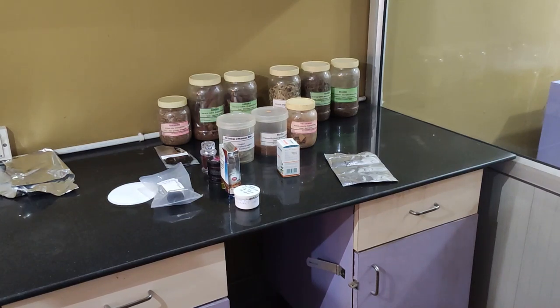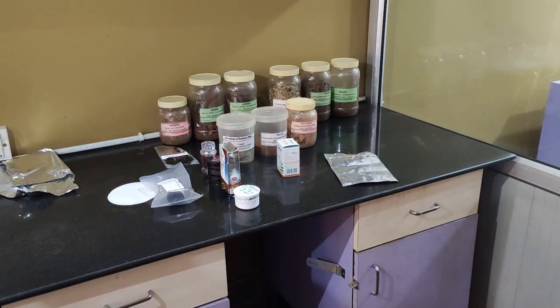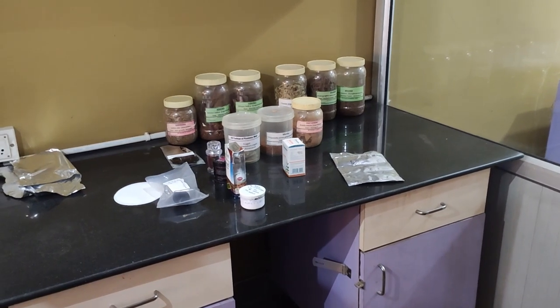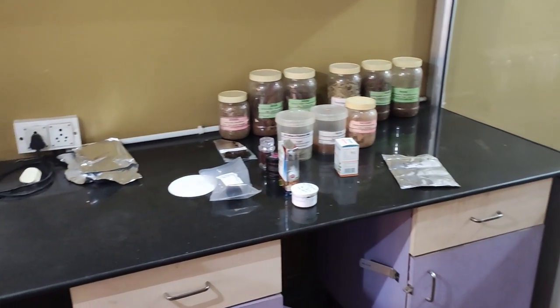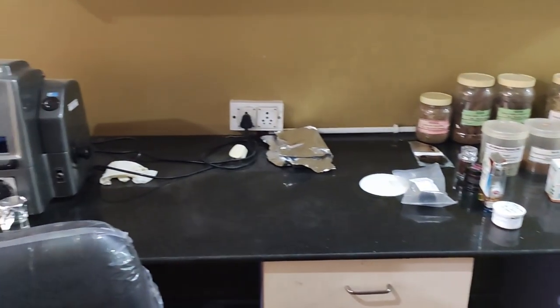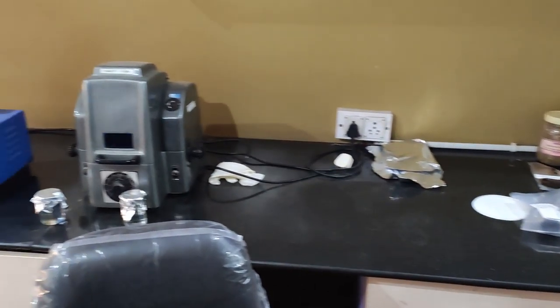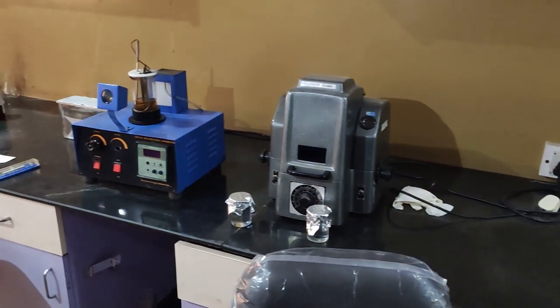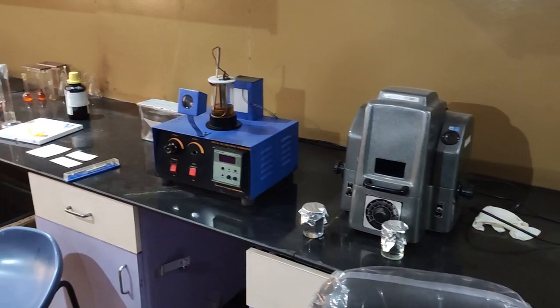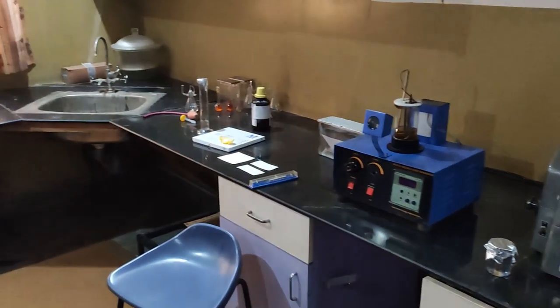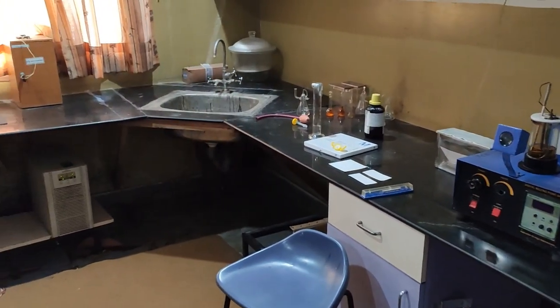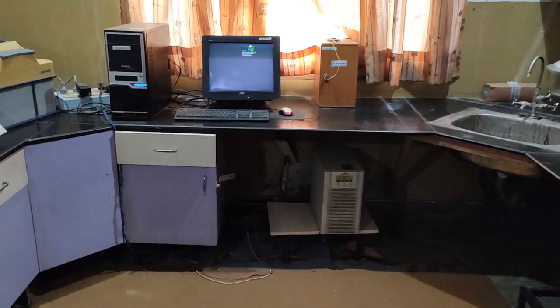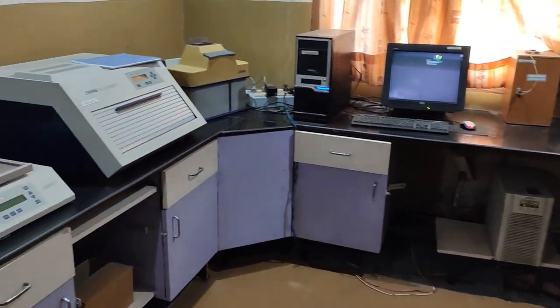This instrument is used for the analysis of non-volatile organics such as pharmaceuticals, APIs, botanicals, forensic, food, specialty chemicals, herbals, and many more for establishing purity, impurity, and fingerprinting profiling.